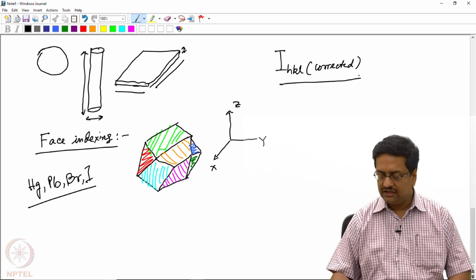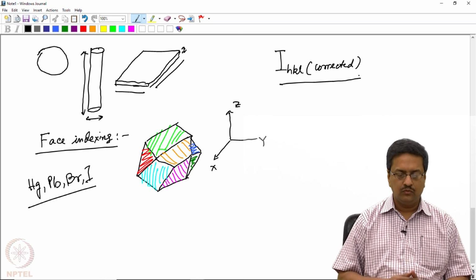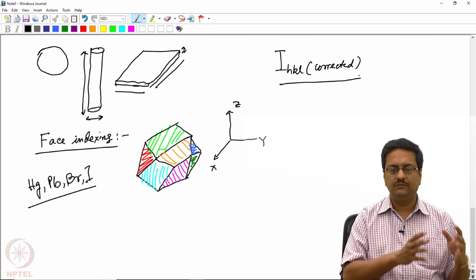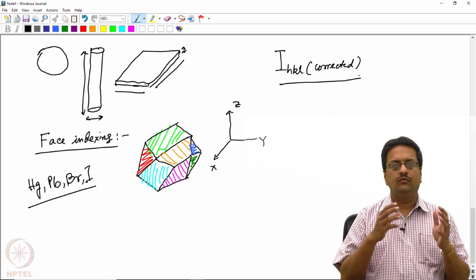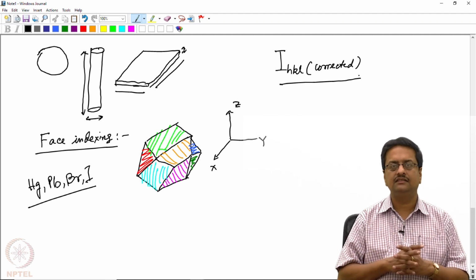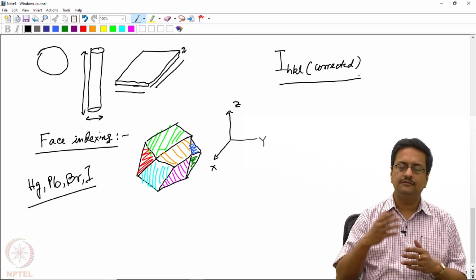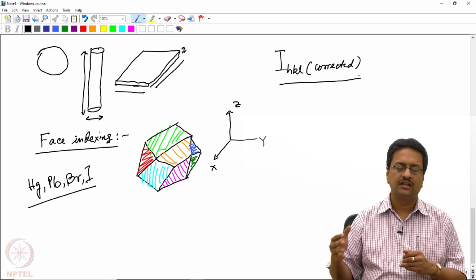So in today's lecture we just learnt about some basics of data reduction. We have understood that the data that we are recording is highly dependent on some parameters on which the diffractometer is built. One point I want to mention here is that the sample to detector distance becomes an important aspect, because with the sample to detector distance increasing, the diffracted beam intensity decreases drastically.